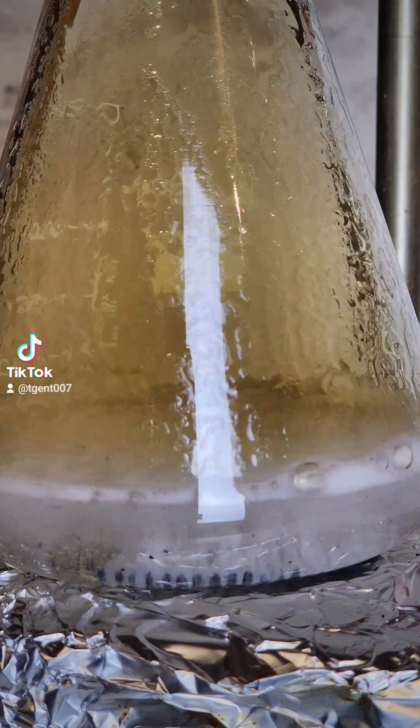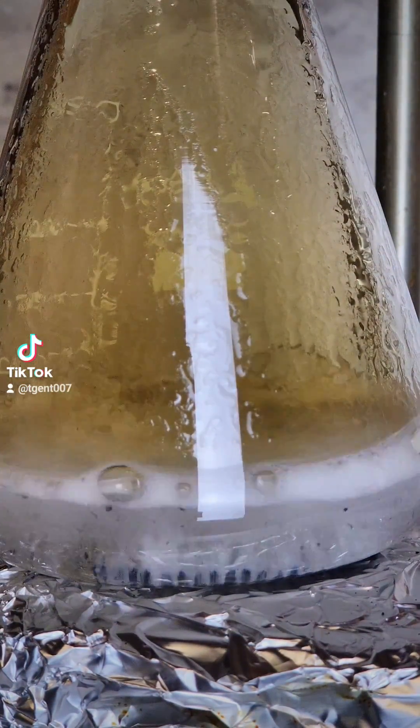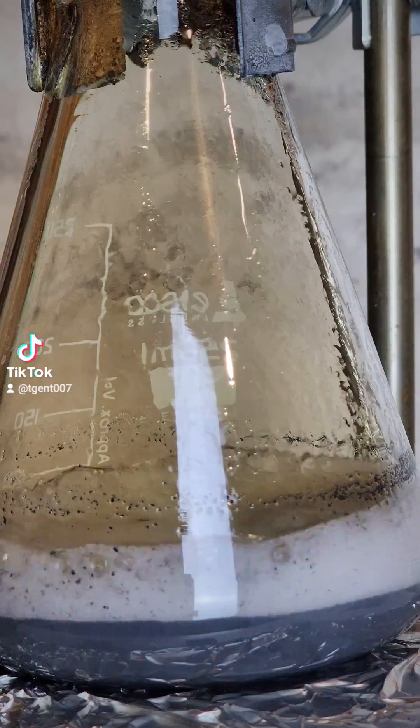The lead begins to dissolve. At this point, I cut the heat.